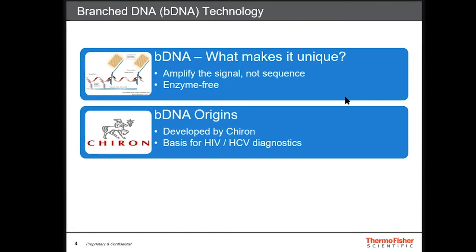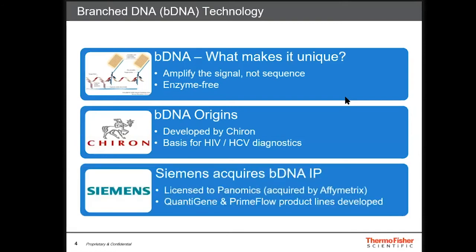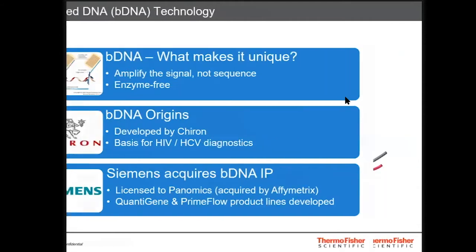They were looking for an assay to use in conjunction with compound screening, where they could basically take cell lysates, lyse and go directly in an ELISA-based assay, similar to an ELISA, but look at an mRNA target together with compound screening. So they developed a buffer that was compatible with subsequent hybridization events to allow detection. That technology moved forward and actually became the basis of not only a screening product for single-plex assay, but also a clinical product for HIV and HCV assays, initially by Bayer Diagnostics, and then Siemens has acquired them. So it's still being sold today as a clinical product, but we're looking at it as a research product.